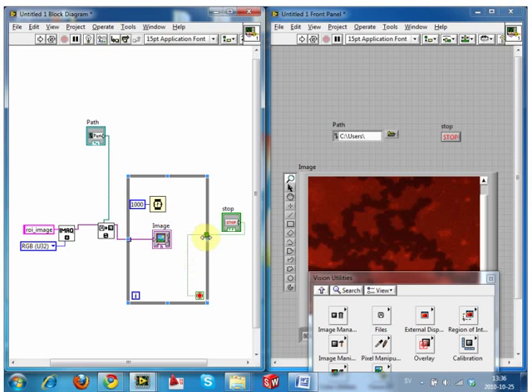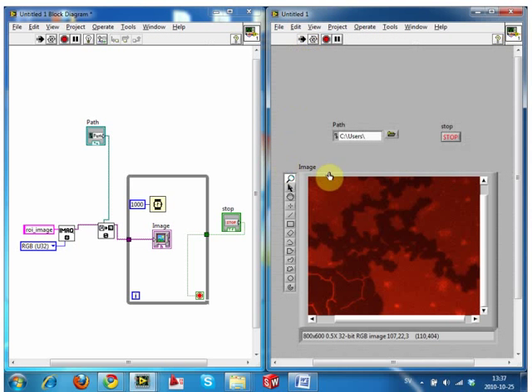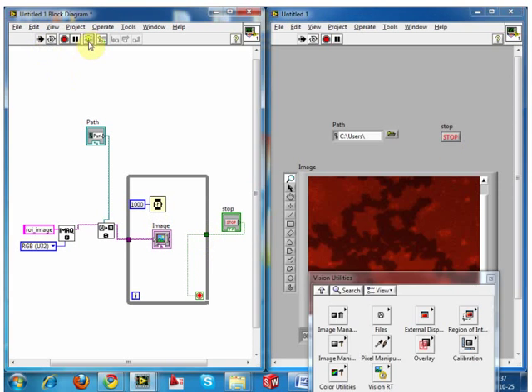But this value will never change because it won't read anything outside the loop. So if I action this now, it will go indefinitely, and I'll have to essentially break the program to make it stop. I've slowed this down to 1 second so that I've got enough time to hit the stop button. But if I didn't have a timer in there, it would just keep going. If I run this now and hit stop, it does nothing, because it already knows what information is coming from there. At the start of this, it was reading false. While we're running it, it won't do the next element until the previous one has finished. So it will keep running this while loop until it finishes. It won't ever read this button.